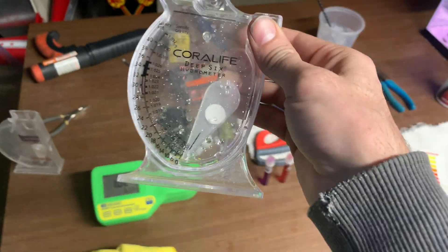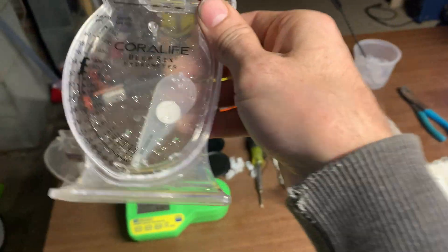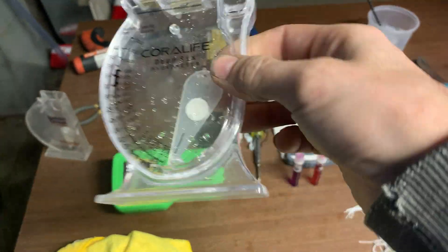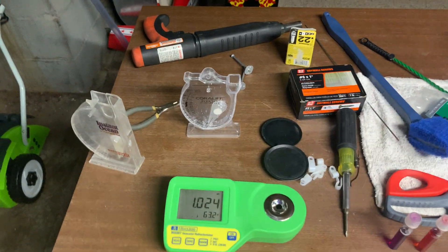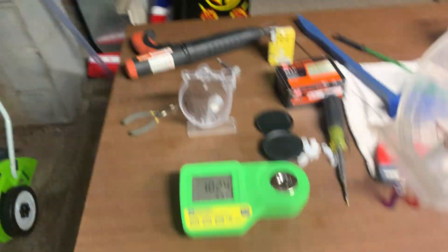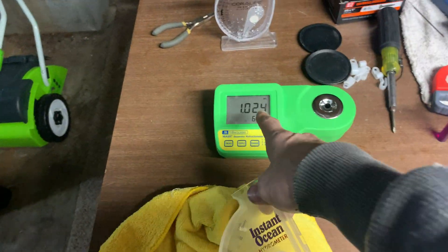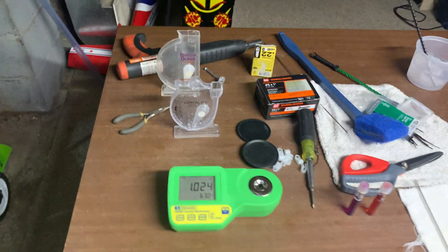A lot of people say hydrometers are not that accurate, but this one — this is the Core Life — I think it's dead on accurate to everything I have. And I do let it sit for a good 10 minutes after I put water in it, because the needle does go up and down a little. Now this one reads whatever these read, but one under. So that reads 1.024, this would be reading 1.023. It's just how it is — it's 10 years old. It's probably knocked out of whack.